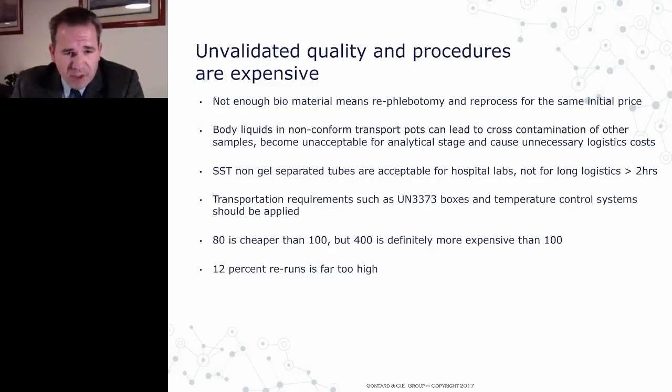One of the largest excuses and cost generators is lost tubes. And lost tubes are not usually declared as lost tubes in the laboratory. There is a magic excuse that pops up: not enough biomaterial. That means that you don't lose face, and the whole chain of the laboratory doesn't lose face, but still you have to repuncture the patient and take again a sample.